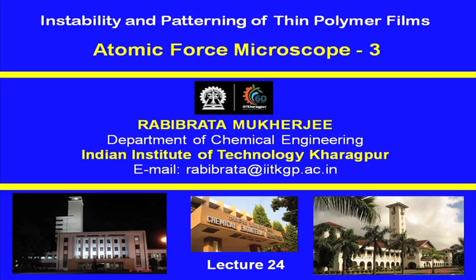Welcome back. We will continue discussing the atomic force microscope. We just got introduced to the concept of an AFM in the last couple of lectures. So, today we will do a quick recap of the major hardware components which we have already talked about, and then we will move on to the basic working principle of an AFM.